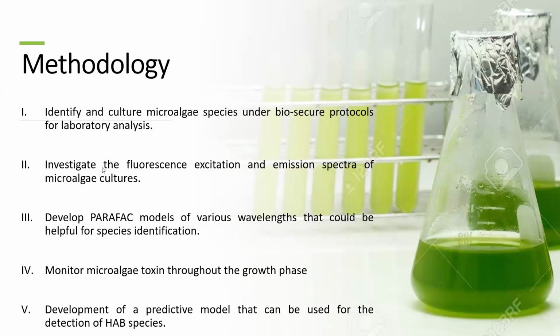Also, the microalgae toxin will be monitored throughout the growth cycle to evaluate the stage of growth and what conditions trigger toxin release. And finally, a predictive model will be developed using the excitation emission matrix to identify the microalgae species. This model will be tested using mixed algal samples and water samples collected from aquaculture facilities.